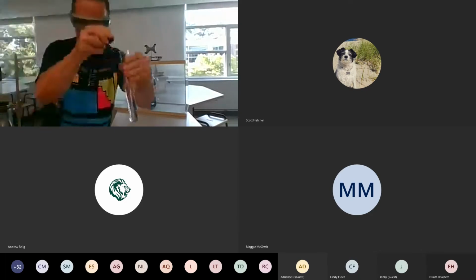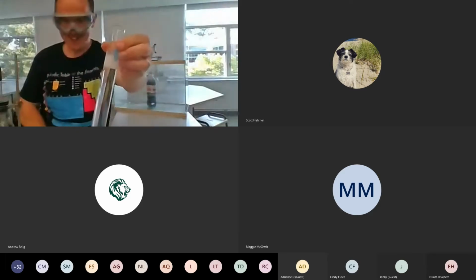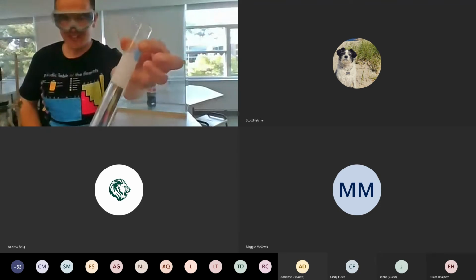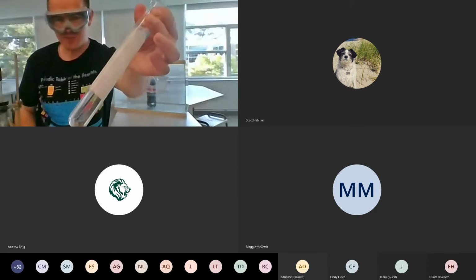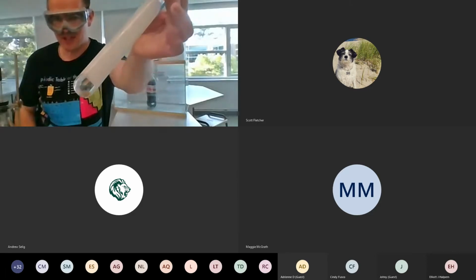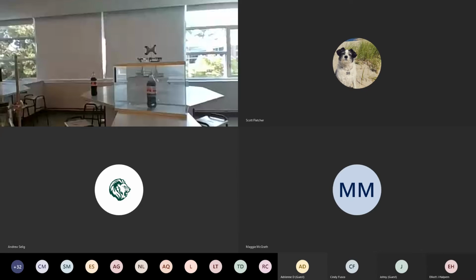Now, since I have another test tube, and I don't think I'll need it till next fall, we'll add that in again. I use this demonstration early in the year to illustrate the idea of polyatomic ions, which are ions like sodium and chloride, but they have more than one atom. And the idea of being unstable, because this is just waiting to change, just waiting to crystallize out. And you can see it goes all the way to that. Okay, so we'll go back to the presentation now.